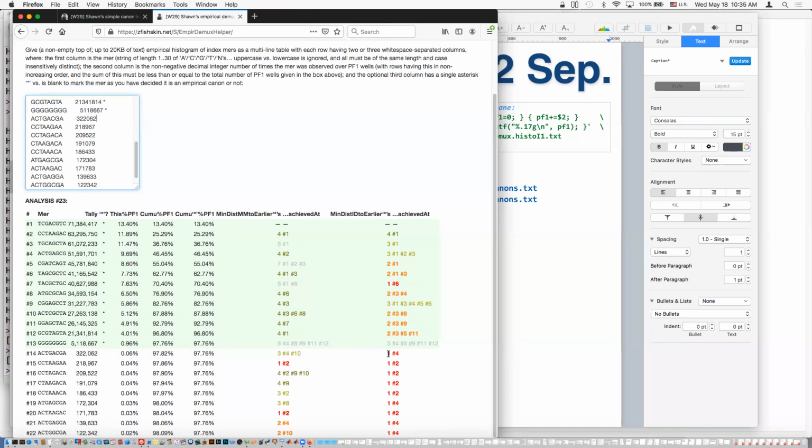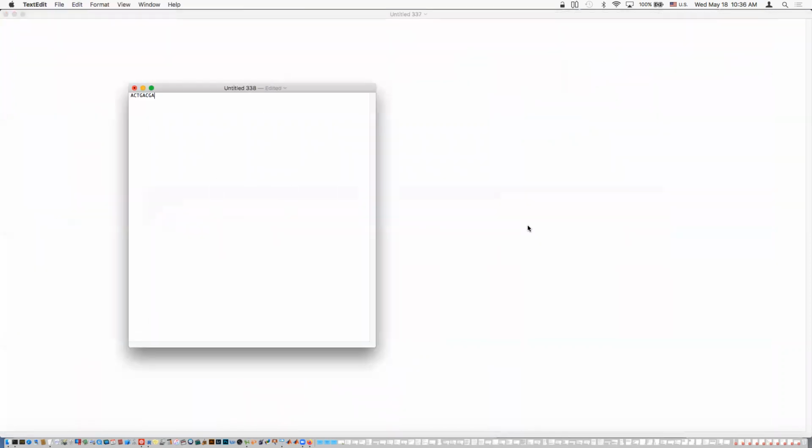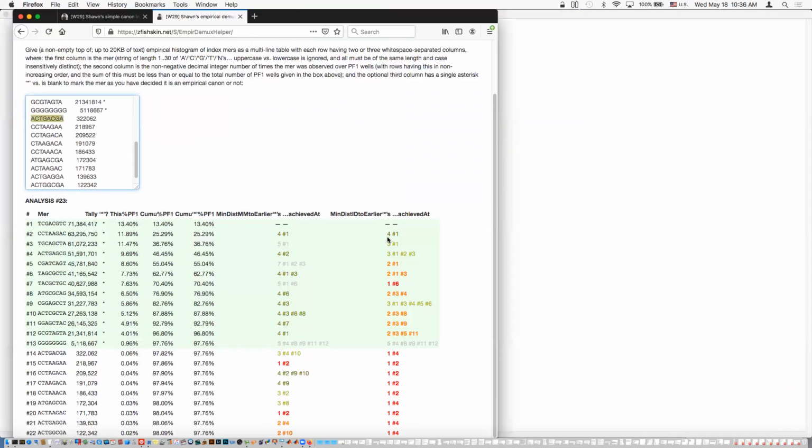But then look at the next column, which is the indels, right? He's only 1 indel away from number 4. And here's the representation break. He's an indel corruption of a guy. Right? So just to see that, okay, that's the one we're looking at right now, number 15 or something, oh, it's number 14, really.